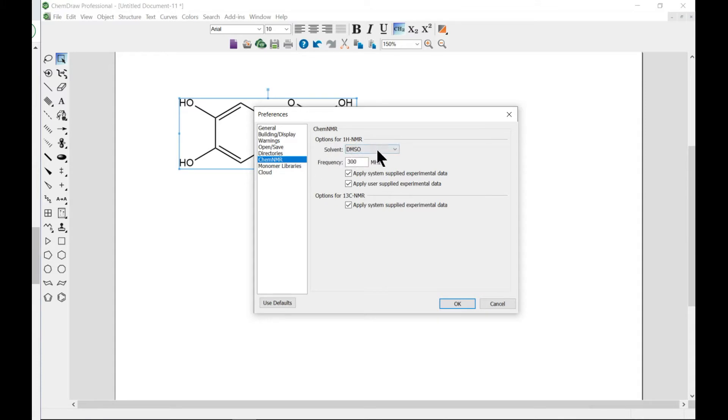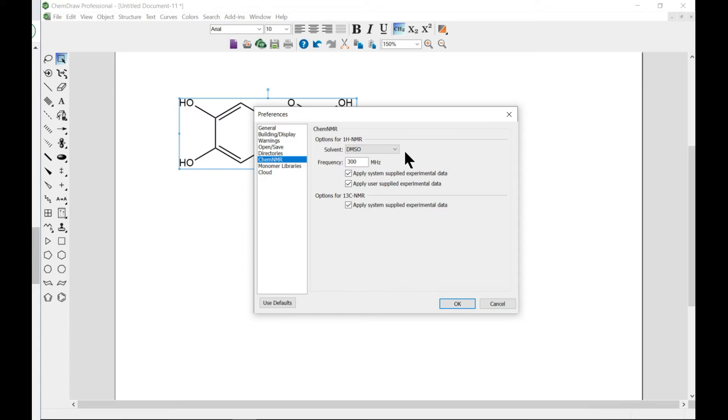The first one is your solvent. Now the solvent is not user definable in ChemNMR, except by adding new custom shift correction data. Most spectra in the default ChemNMR database are run in either DMSO or chloroform, but the database is intended to be solvent free.